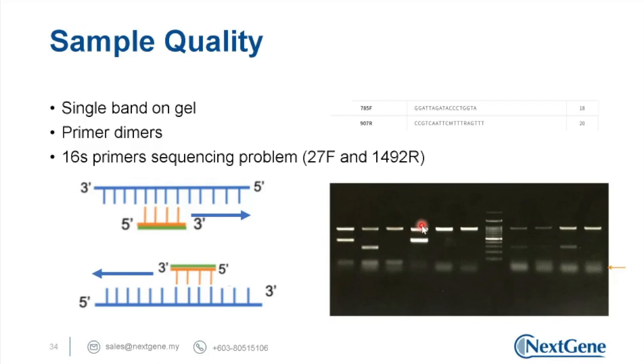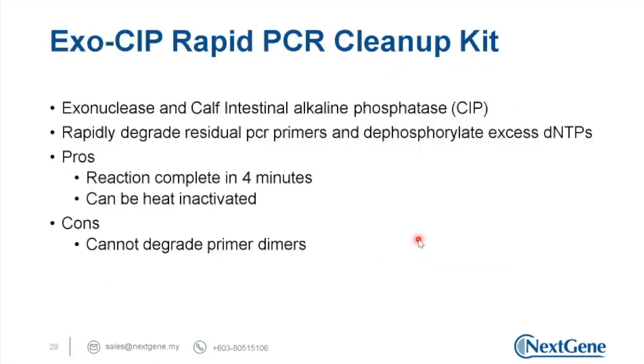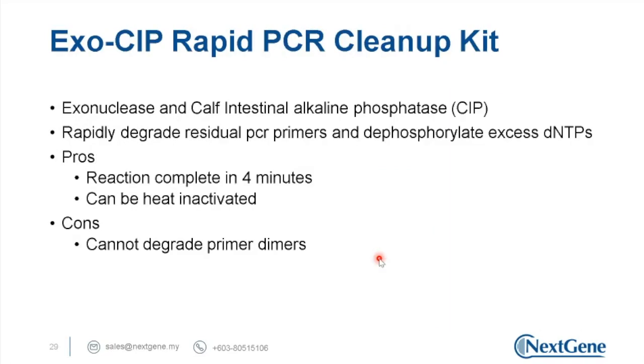Or after we purify using gel, two reactions, we then do an additional purification using normal PCR cleanup, combining the two tubes of gel extracted band. So we perform gel extraction first, we get two tubes, and then we combine them using, let's say, a PCR cleanup.